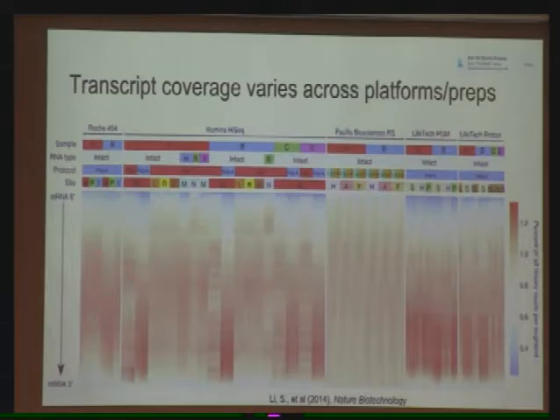So we have a lot of reads in that transcript that came from the middle of it. So it's just, when you were preparing your library from your sample, how uniformly did you get the reads? Did you sample reads across your transcript, is what you're trying to assess.